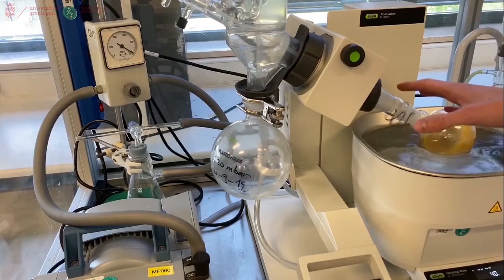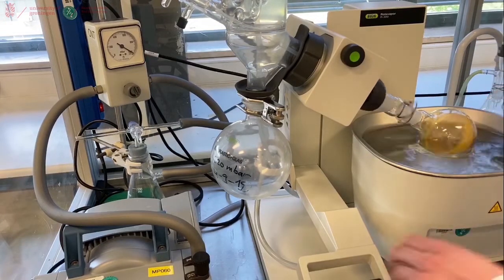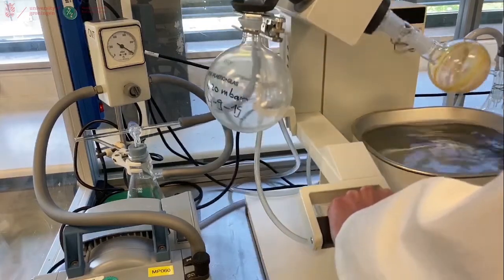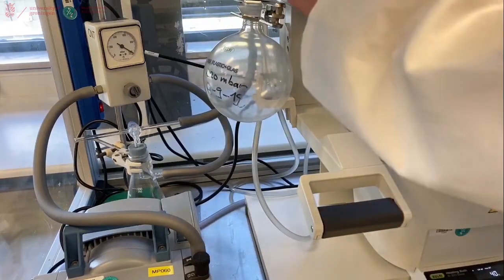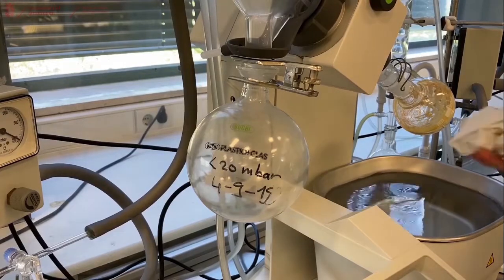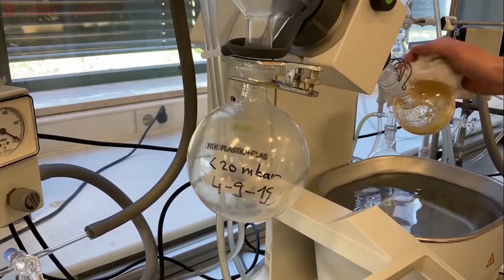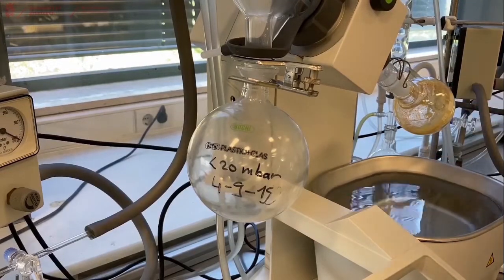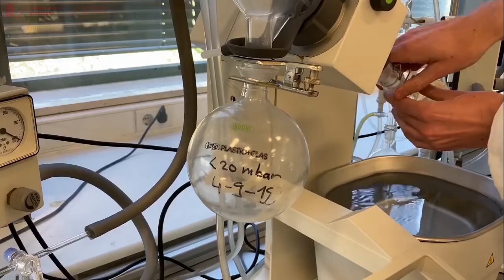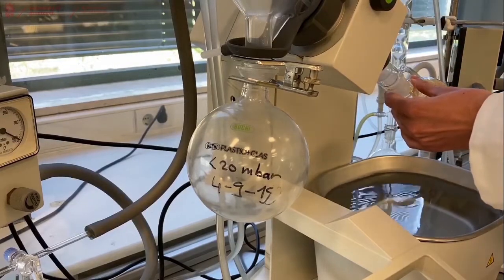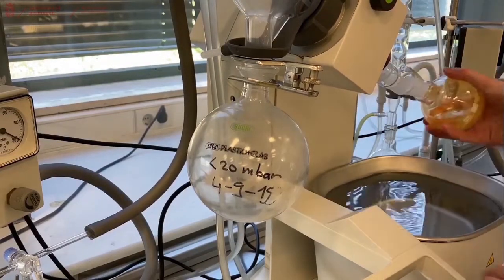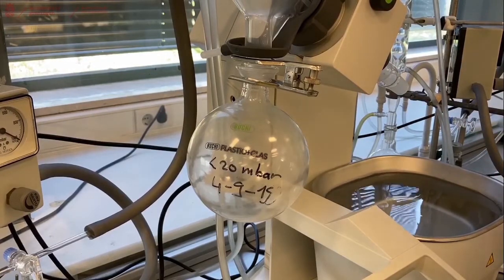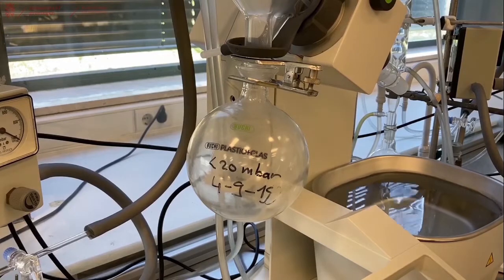Now that the system is back under atmospheric pressure, we can collect our flask by removing it from the water. Turn off the rotation. And dry the outside of your flask with a bit of paper. Now carefully remove the flask from the Rotary Evaporator. And place your stopper on the flask and take it back to your fuel mood. To continue on with the rest of your experiment.